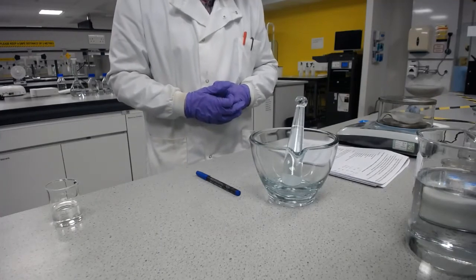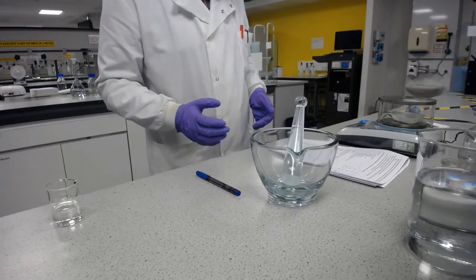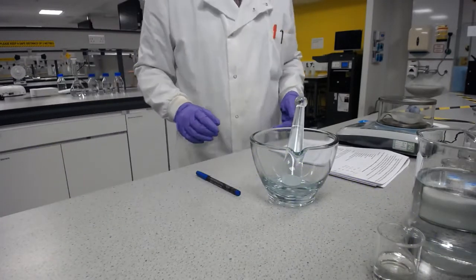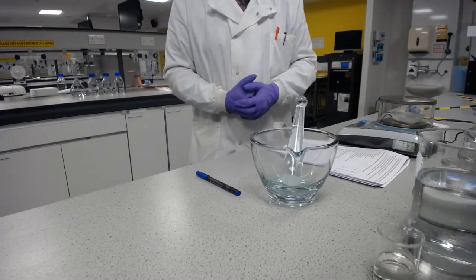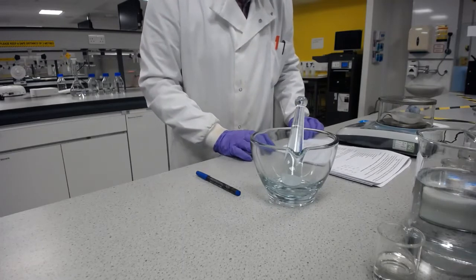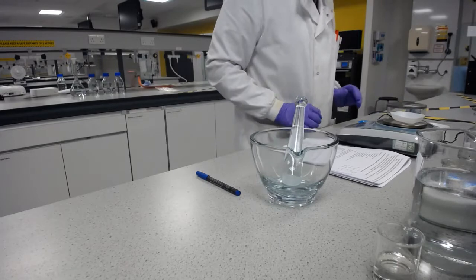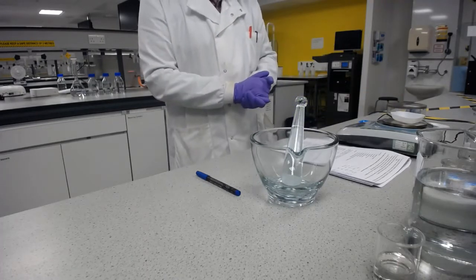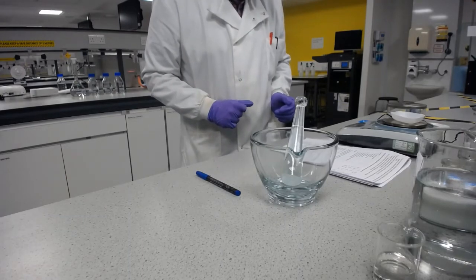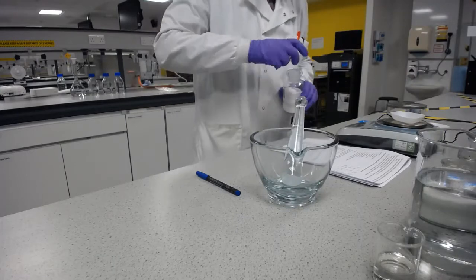And one of the key ingredients that's the same in all of them that will slow this down is glycerin, which you will find is a very viscous liquid, and that will be changing the viscosity of the water to slow down that sedimentation process. So I'll get on and start putting all of the solid ingredients in, and of course we're going to weigh them out on the balance, and as if by magic I have a previously zeroed weighing boat here. So the first one that we need to do is to weigh out 7.5 grams of calamine.